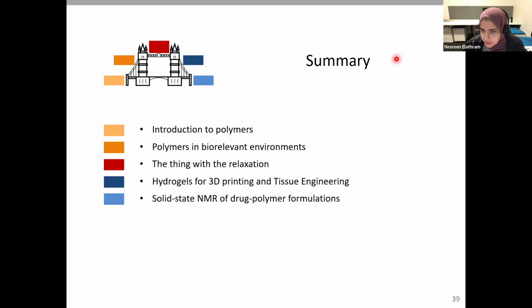Okay, cool. So we have another question from Yongsho. So, for the biorelevant media, can DOSY NMR differentiate and quantify the micelles and monomers of surfactants in the solution?